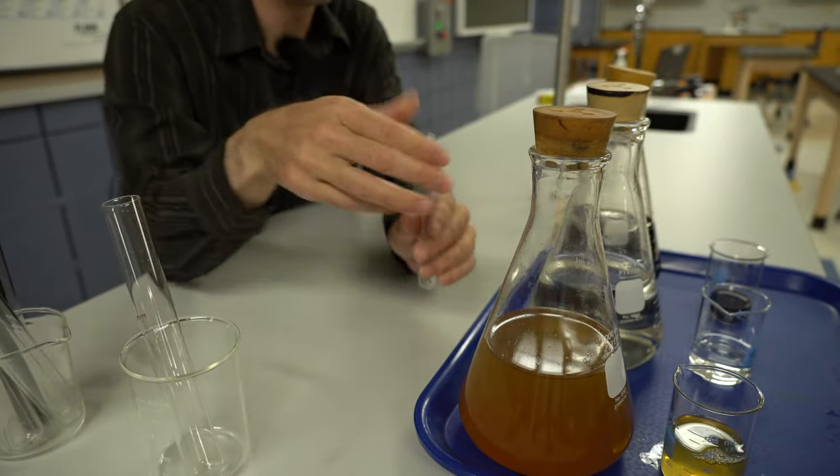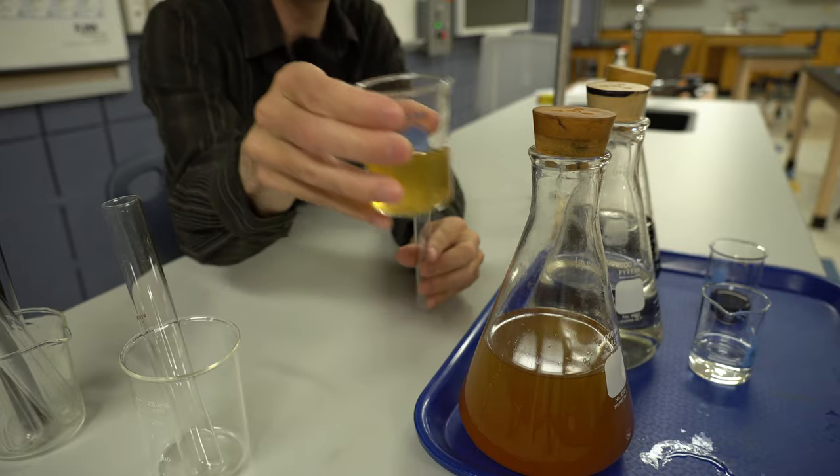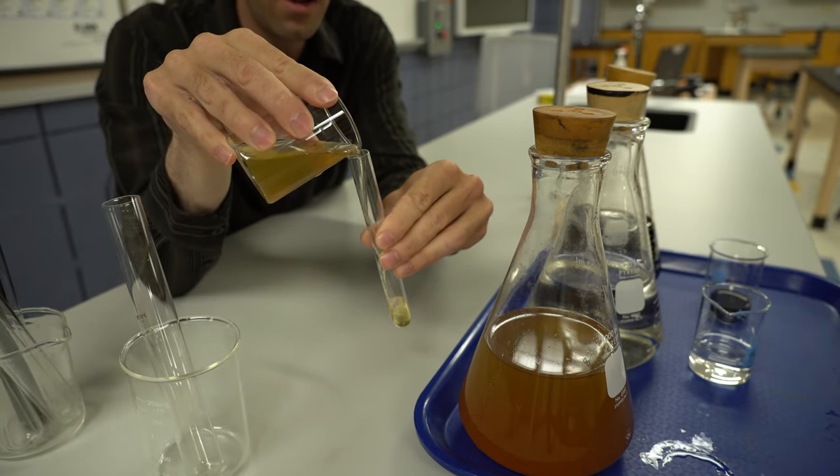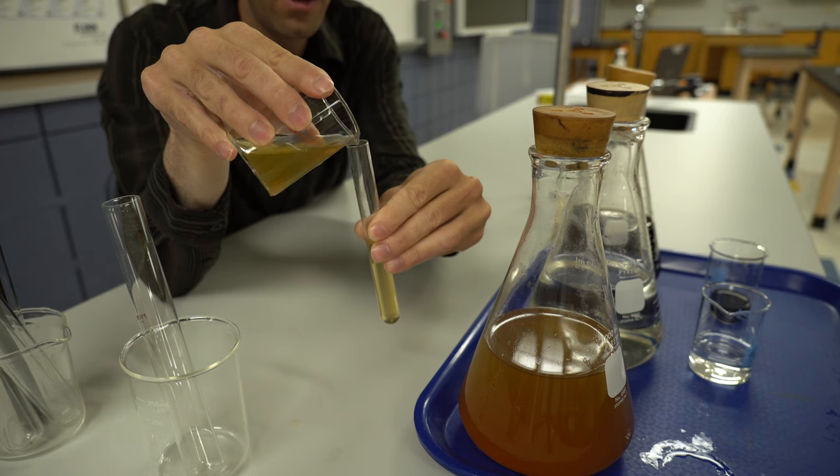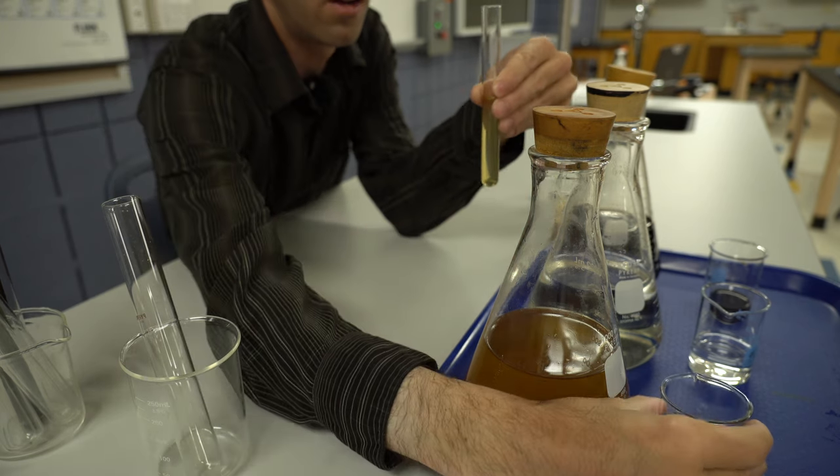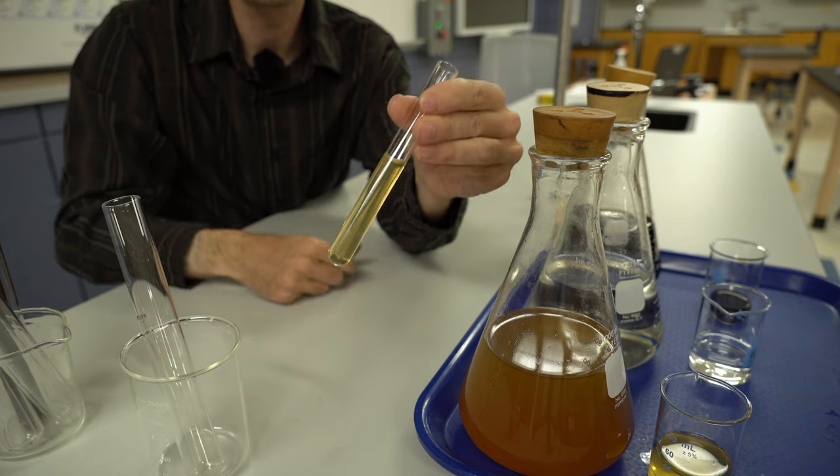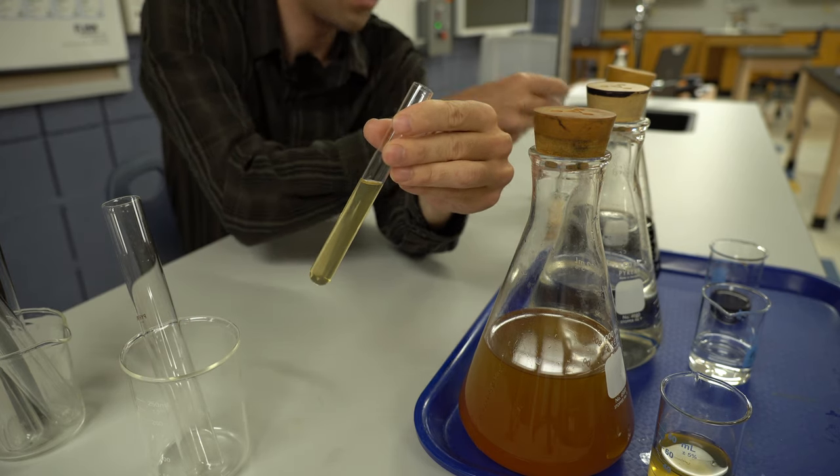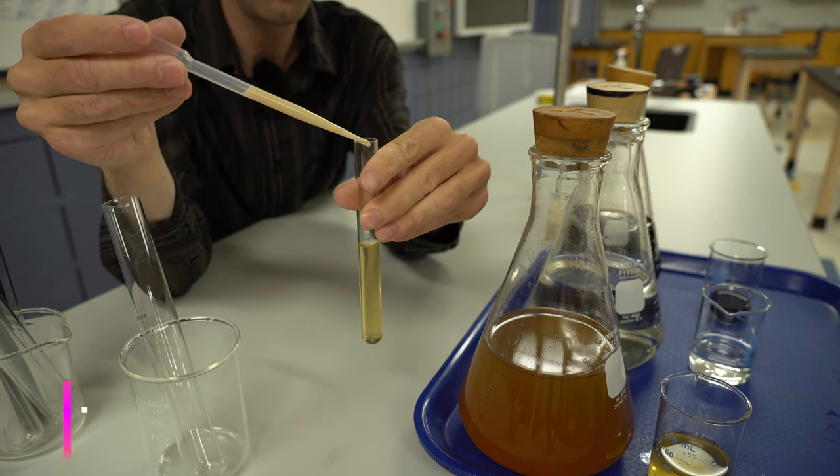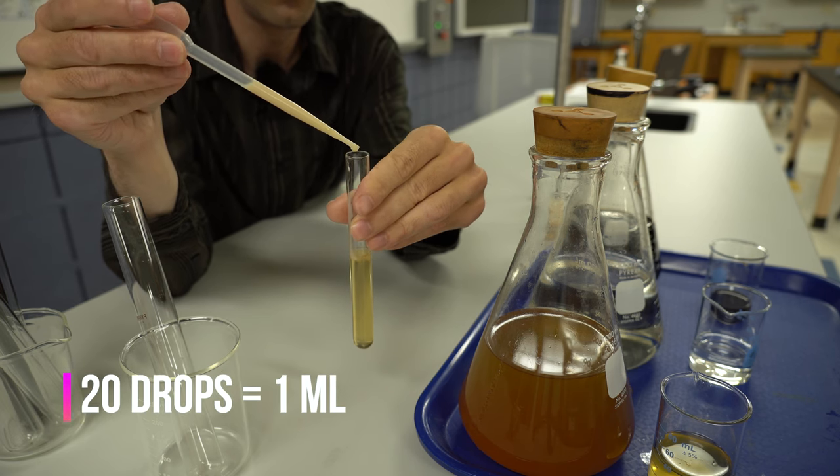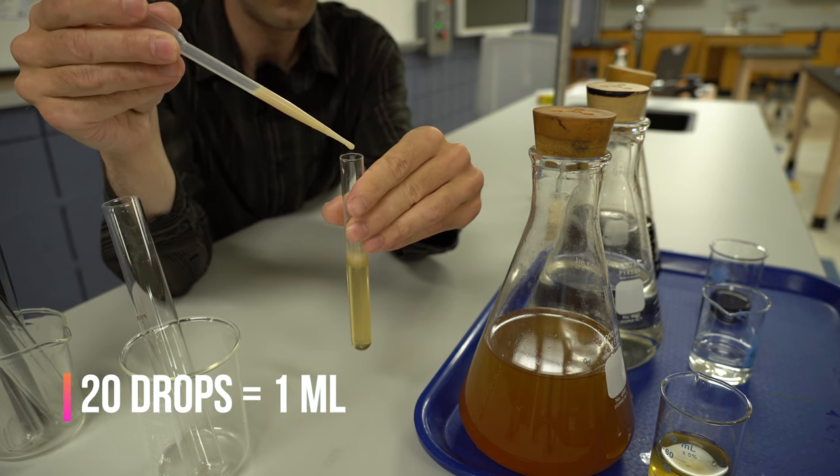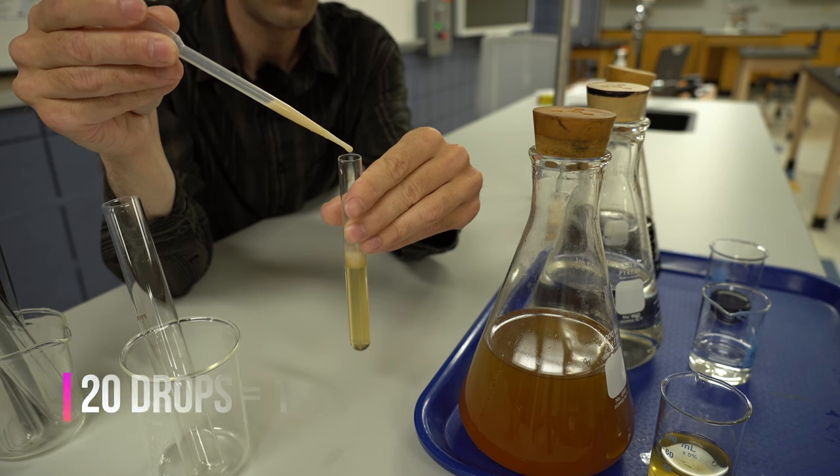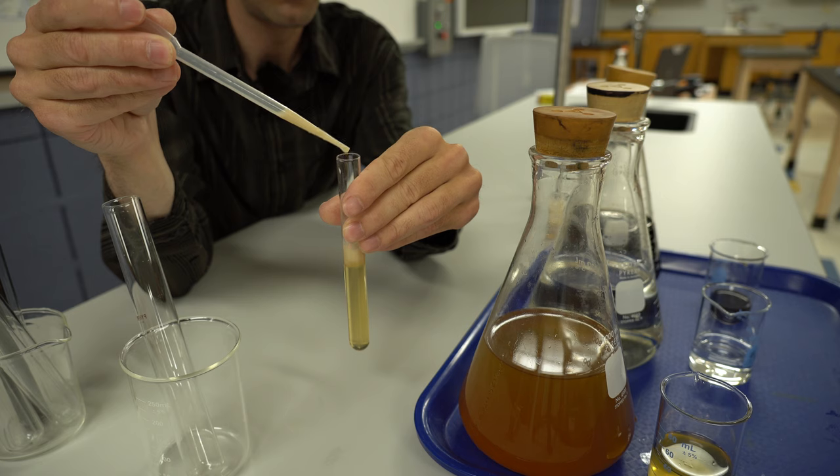We take our test tube. We take our honey solution, which is 20%. We add approximately halfway full of our honey solution. We got our honey solution there. Then we're going to take about 20 drops, which is going to equal one milliliter of our yeast solution. That's 20. Perfect.